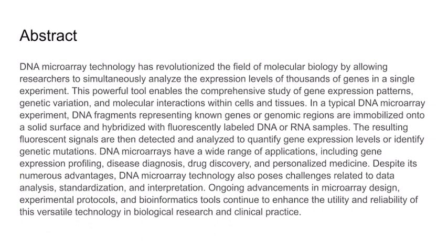In a typical DNA microarray experiment, DNA fragments representing known genes or genomic regions are immobilized onto a solid surface and hybridized with fluorescently labeled DNA or RNA samples. The resulting fluorescent signals are then detected and analyzed to quantify gene expression levels or identify genetic mutations.